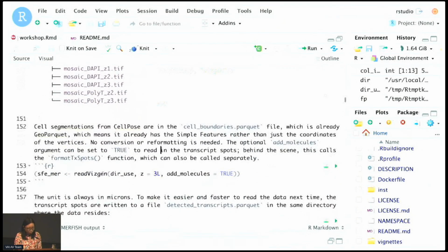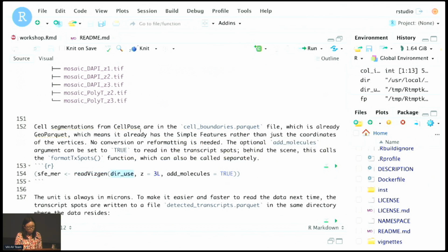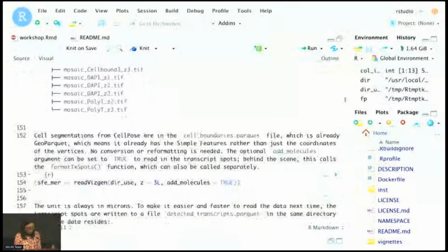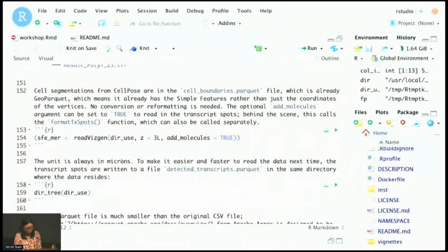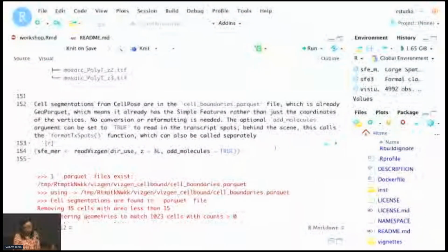So here we use the read VisGen function. That's just the top-level directory of the output shown here. You can select which z-plane to read. For MERFISH there are usually 7, but for cell segmentation they're all the same.